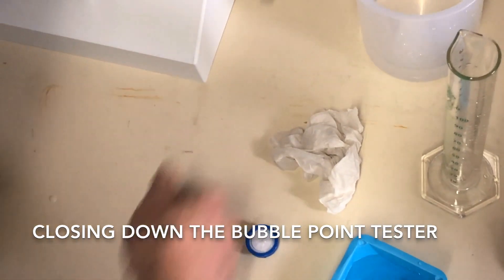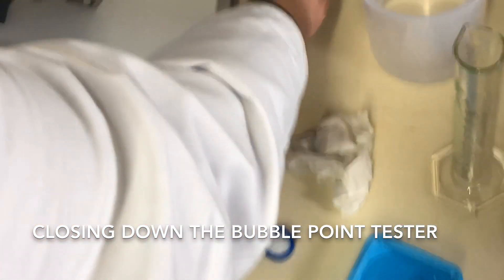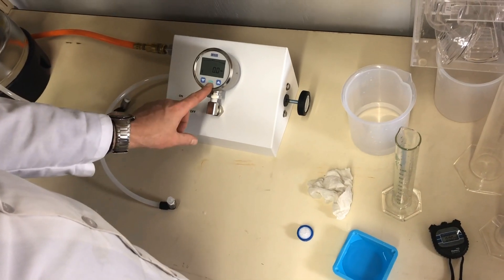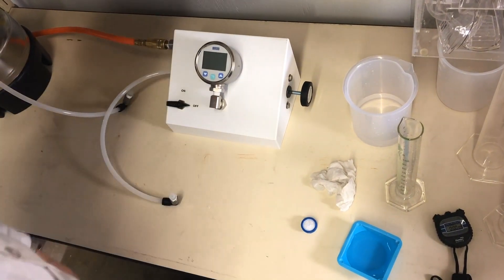Once the bubble point testing is complete — once you've finished testing all of your filters — make sure that you have the pressure turned out to read zero, then turn the air supply off, turn the gauge off, and then you're done.